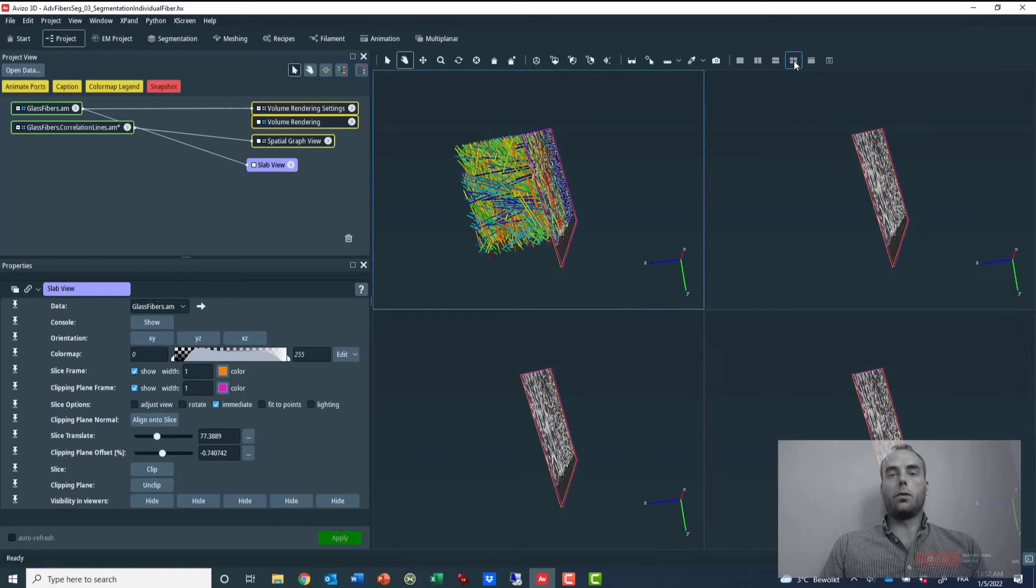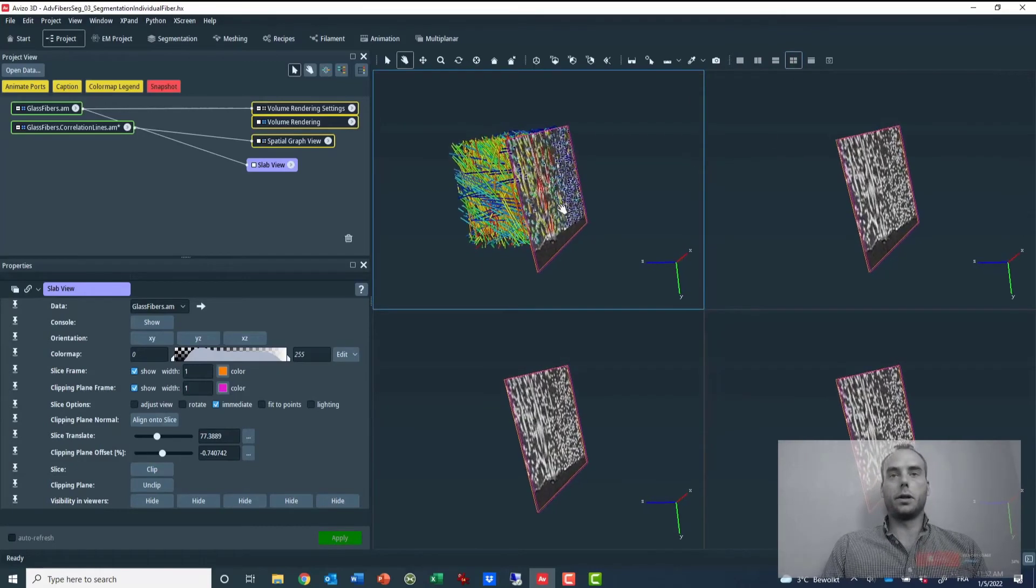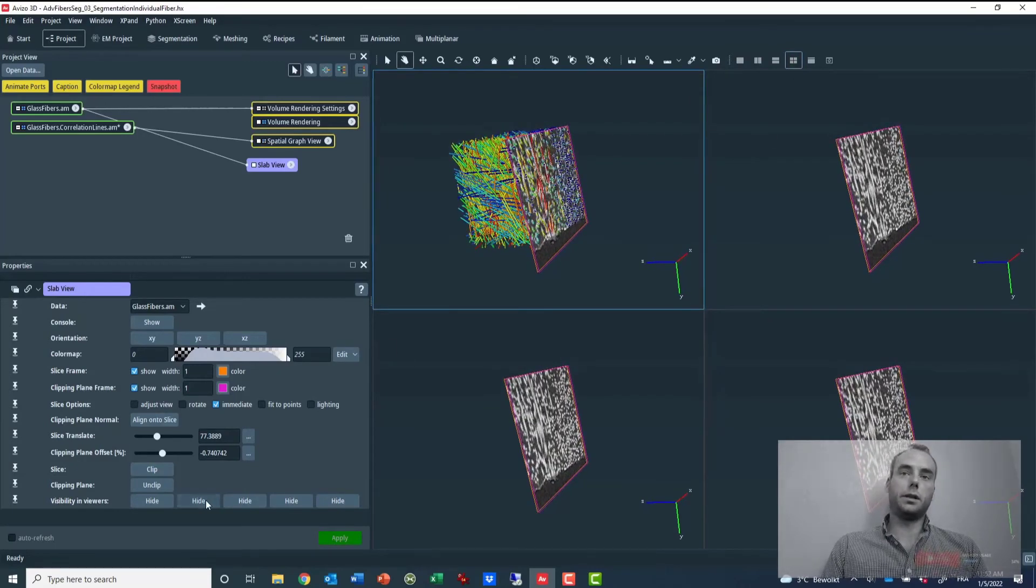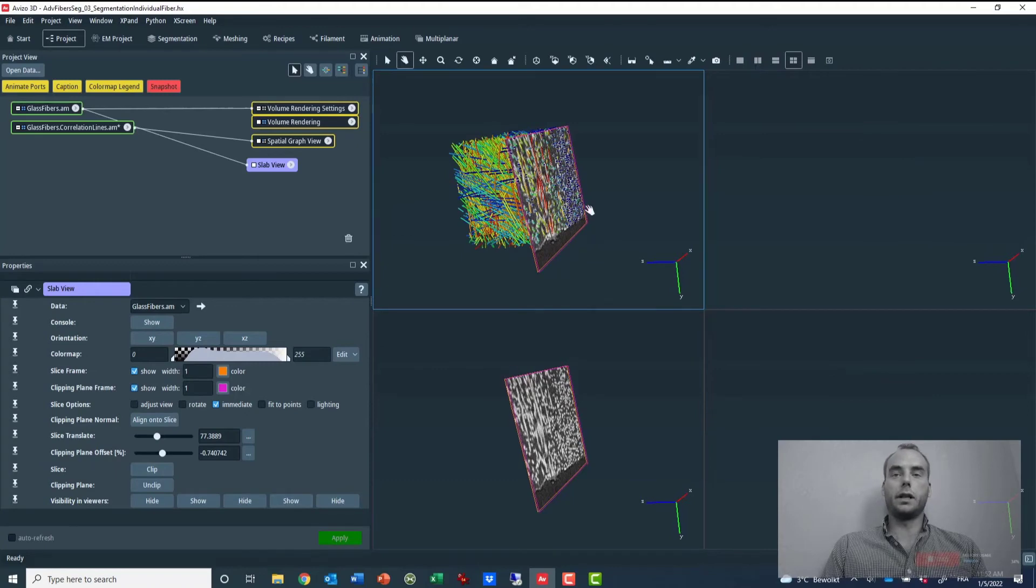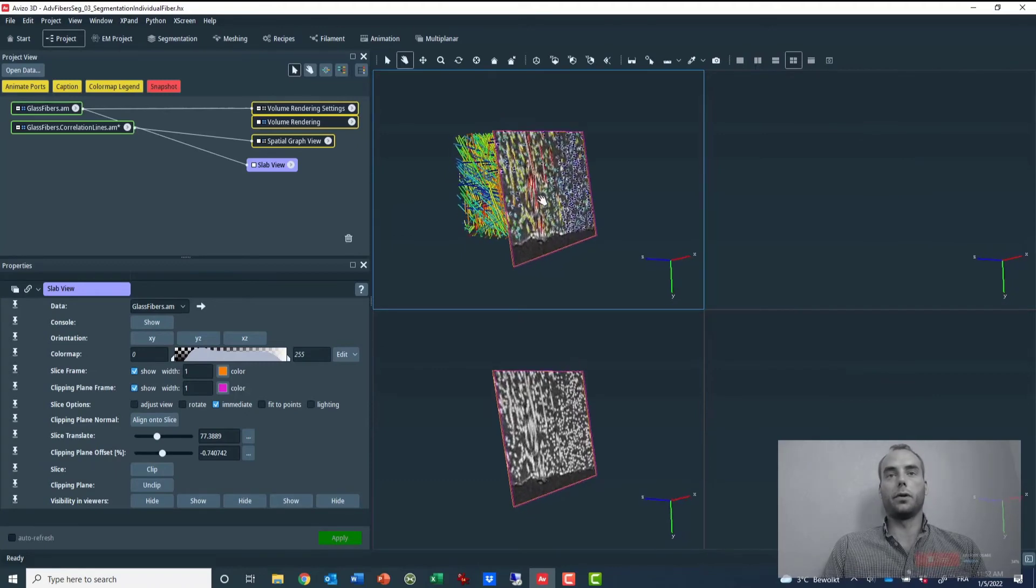I also have the possibility to configure individually the visibility of the SlabView in each viewer.